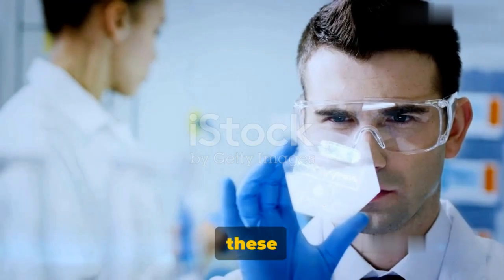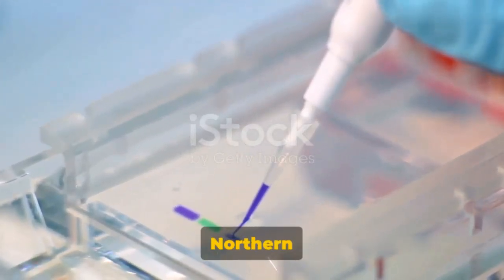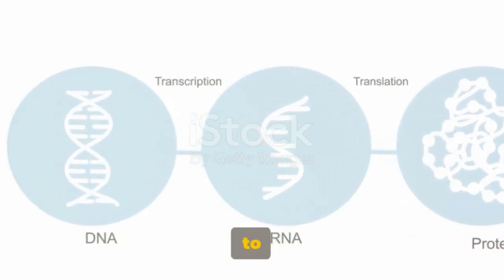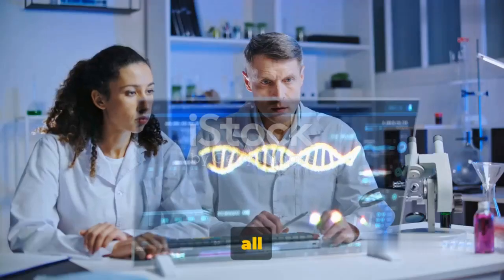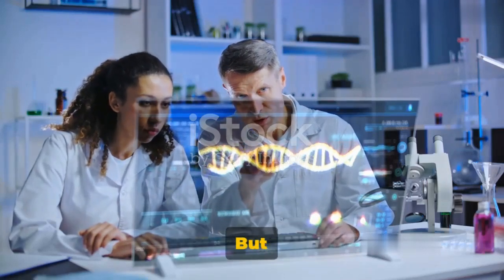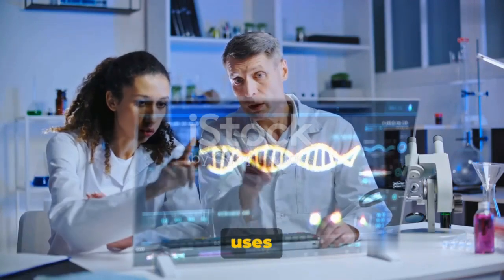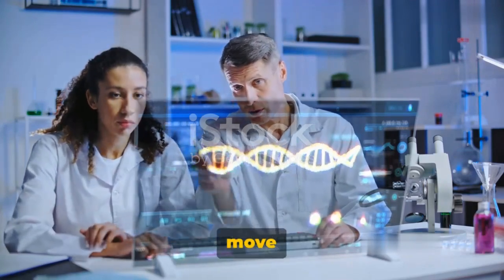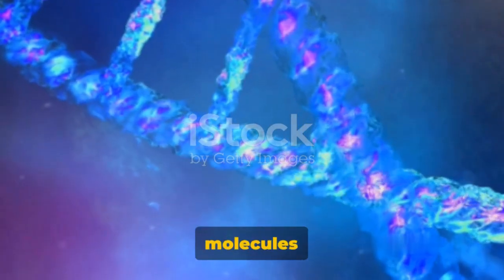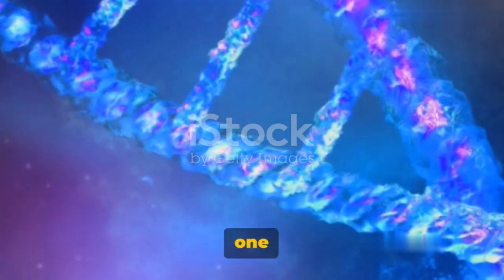So how exactly do these methods work? Let's dive in. First off, we have northern blotting. This technique is a tried and true method to measure gene expression. It's all about separating RNA by gel electrophoresis. But what does that mean? Well, gel electrophoresis is a process that uses an electrical field to move molecules like RNA through a gel. Different molecules move at different speeds, allowing them to be separated from one another.